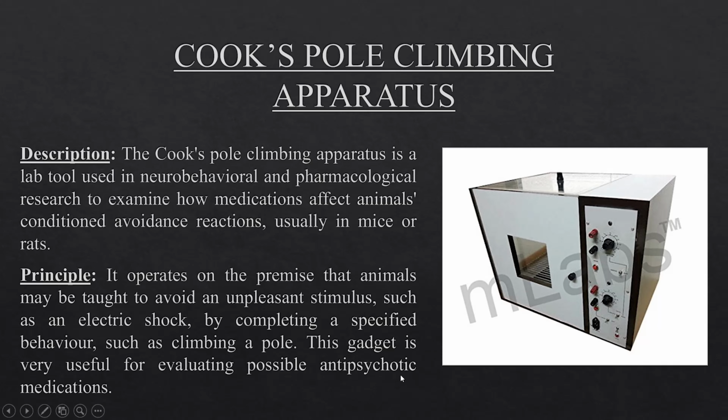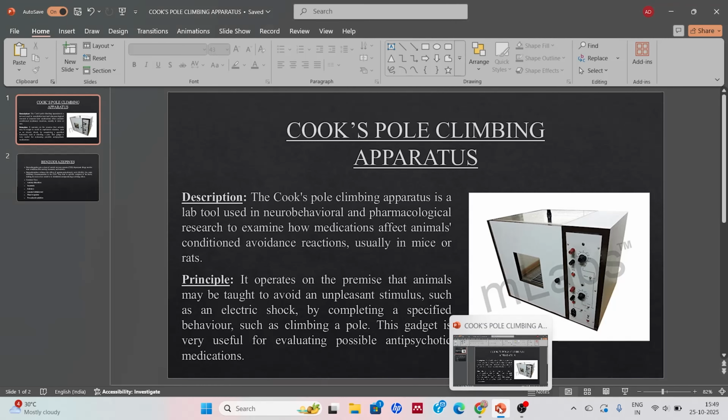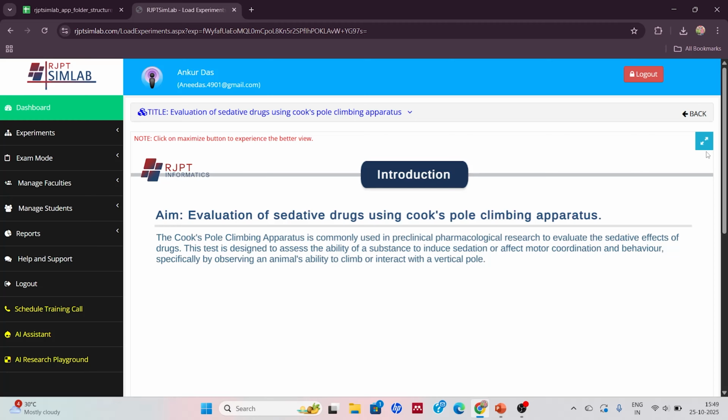As we know, antipsychotic medications have a tendency to induce sedation. Now, let us move forward in our experiment.